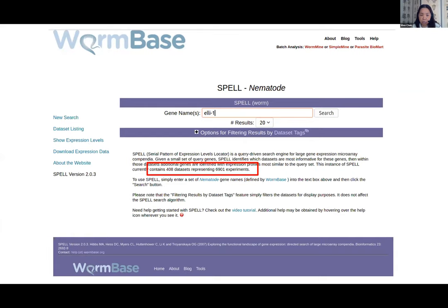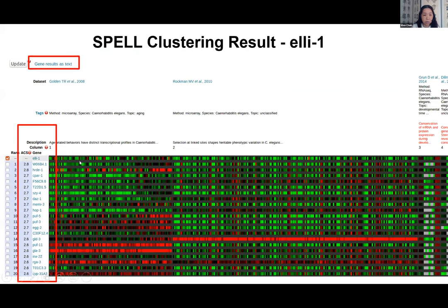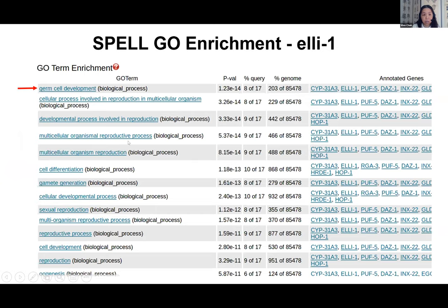If you enter a single gene in SPELL, you'll see a list of genes with similar expression profiles across almost every dataset, ranked by highest correlation. You can download this list as text, take it to Simple Mine to see the functions, expression patterns, and phenotypes of those genes. SPELL also performs gene ontology enrichment to tell you the biological processes involved in the co-expressed gene list. This is the simple search — unweighted clustering analysis in SPELL.